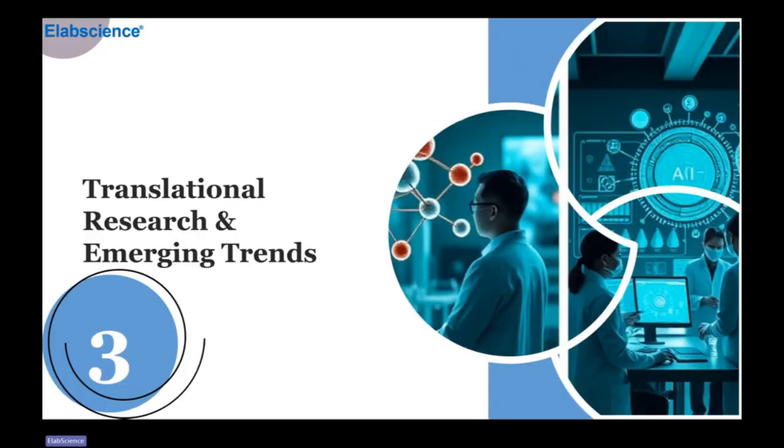Okay, finally, we'll explore how ELISA bridges discovery to translational applications. We will also look at emerging trends and innovations that are expanding the impact and scope of ELISA in modern research.